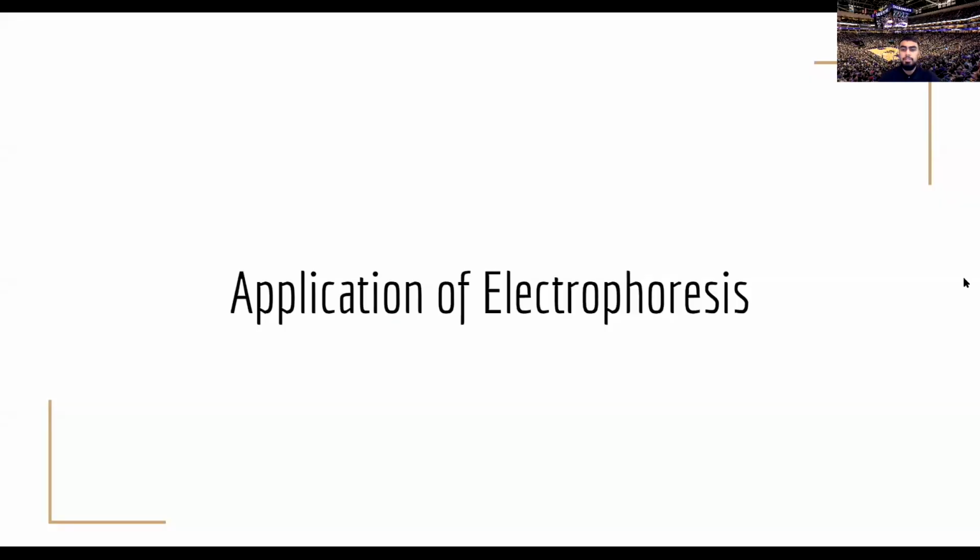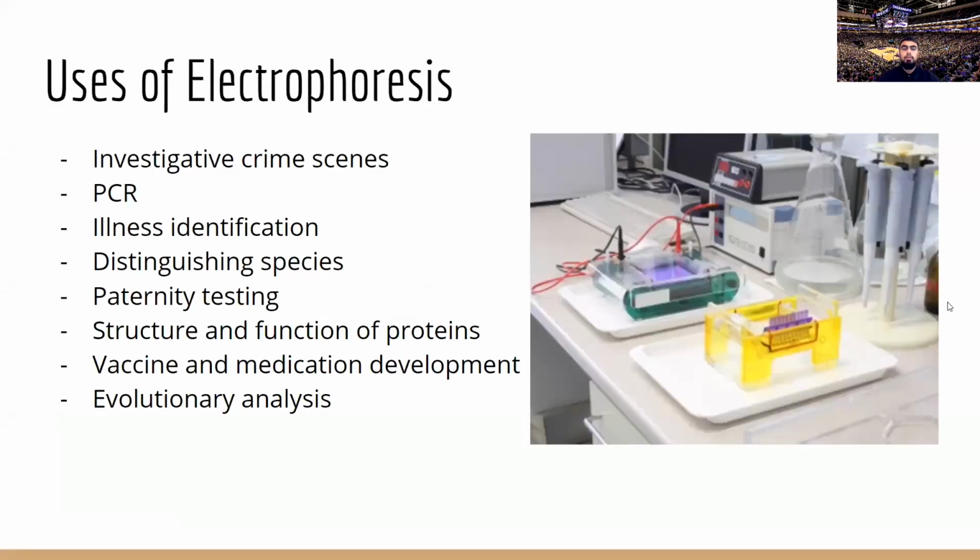Hello everyone, my name is Salim Safi and I will be presenting on the application of electrophoresis. When sample mobilities are measured at several gel concentrations, they are evaluated for the following phases. It allows for exploitation of differences in charge and shape, particle size, and the following.